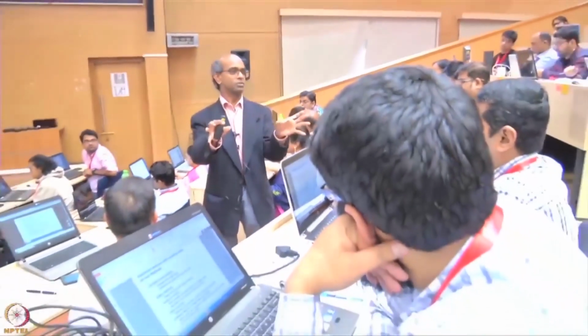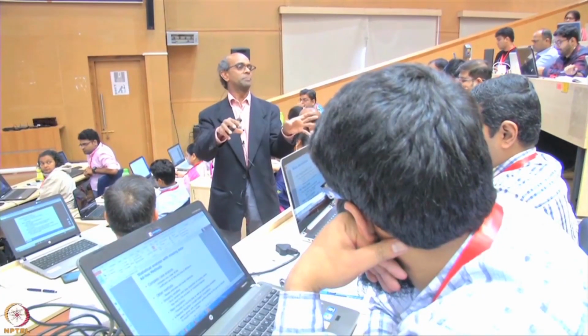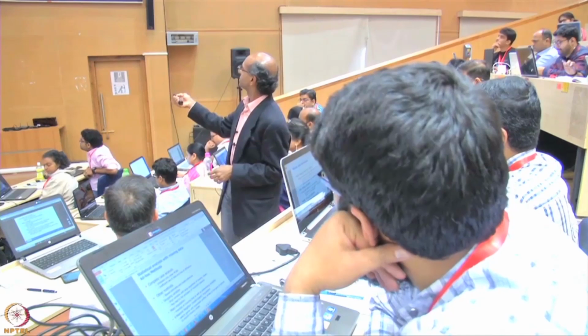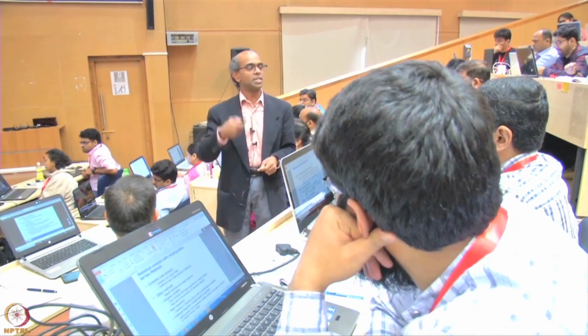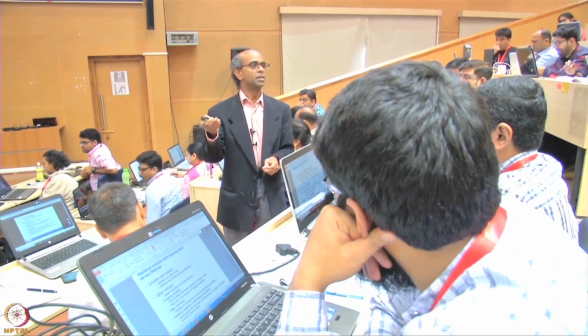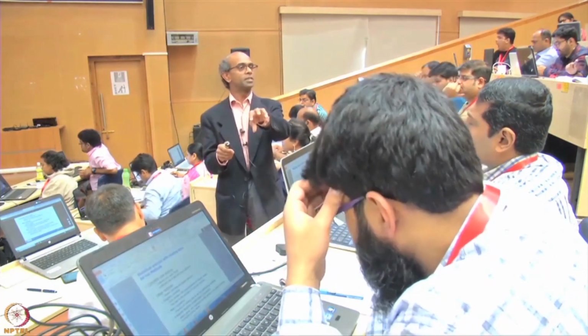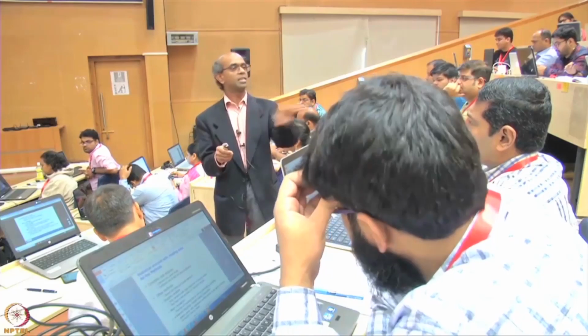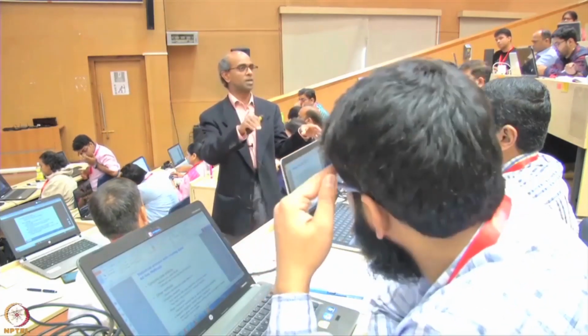Let's say your perfect biomarker is present in your cancer and not in the controls. And so you have 50% cancer, 50% controls. If you set this threshold to be 40%, you will throw away all your biomarkers. So you would set the number to be high enough. So let's say you set it to be 70 or 80%. So then you retain things that are present in only a few of the cancers, but are missing in all the normals and maybe even a few cancers. Then you will keep those markers.